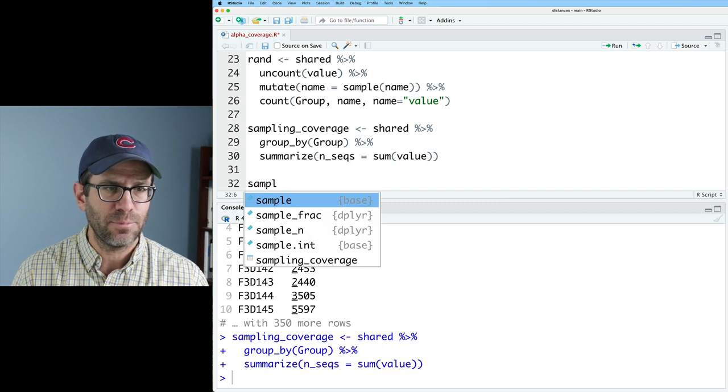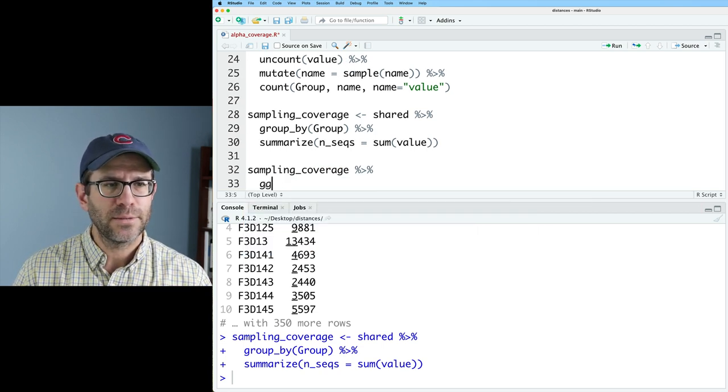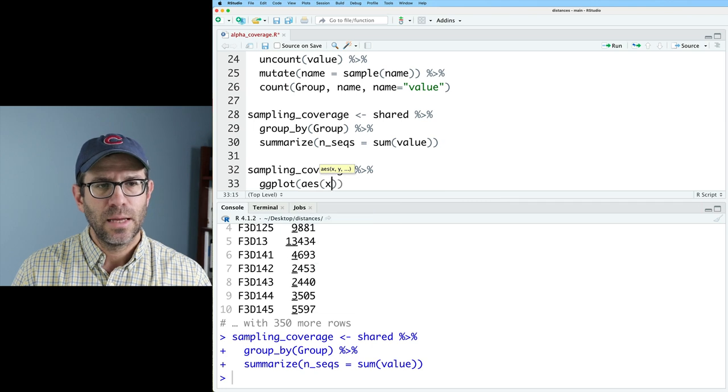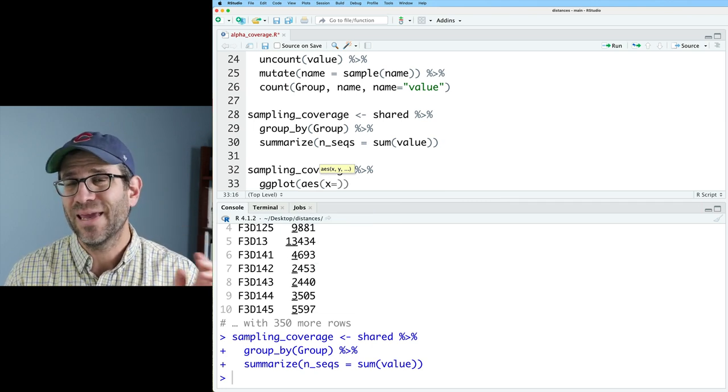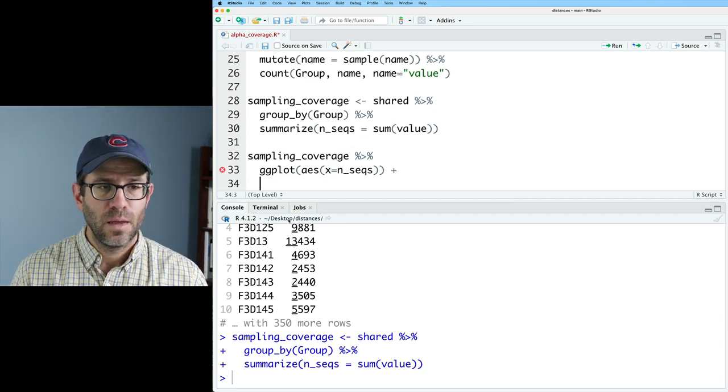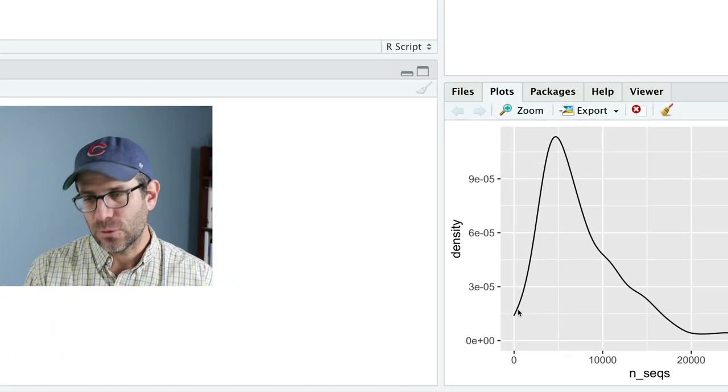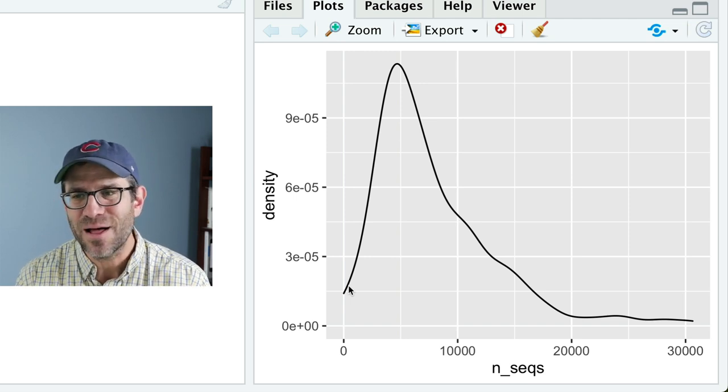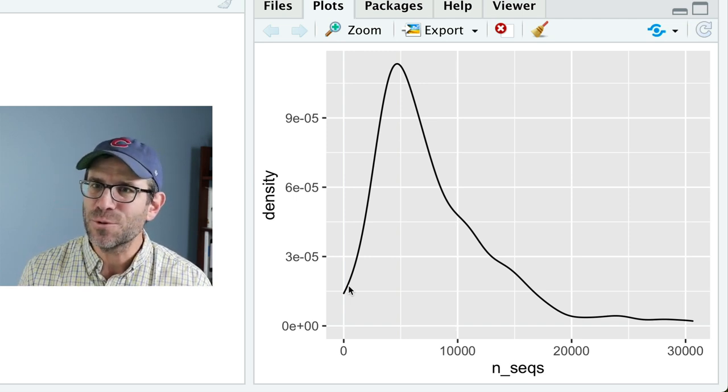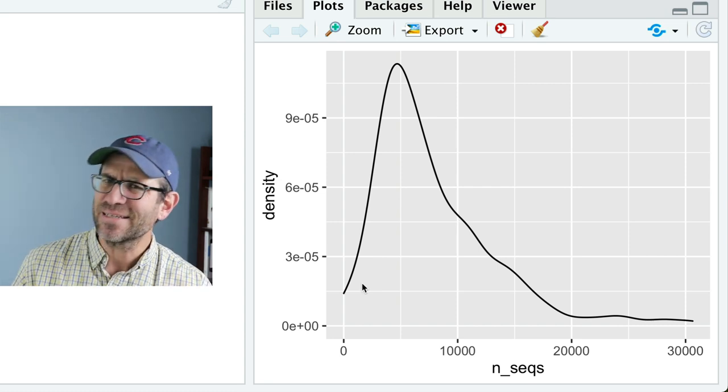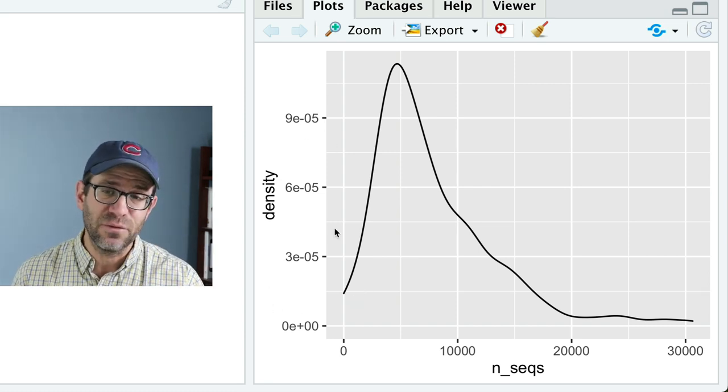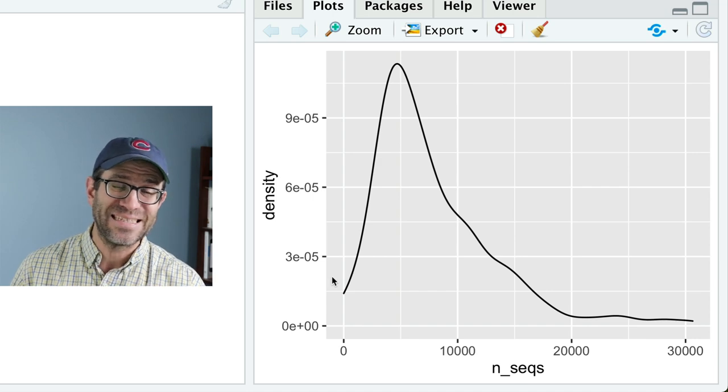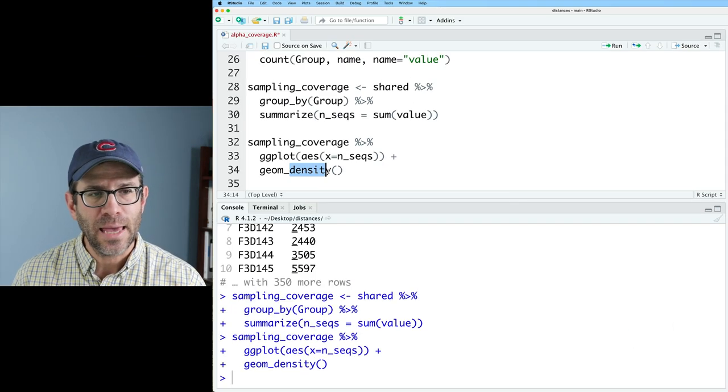Let's go ahead and call this sampling coverage, and let's go ahead and make a few plots so we can visualize the distribution of the number of sequences we have in each of our samples. So we'll do sampling coverage, pipe that to ggplot AES with x. Let's go ahead and start by making a density plot with nseqs, geom density. So there's our density plot. One of the nice things about a density plot is that it makes the curve nice and smooth and pretty. The bad thing about a density plot is it makes it nice and smooth and pretty. I also don't have a sense of the n on the y-axis. I get a density, but I don't get a count.